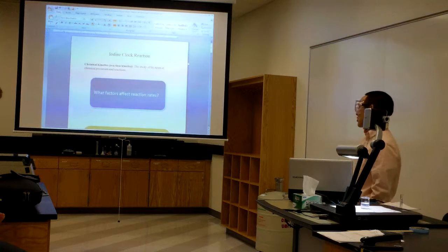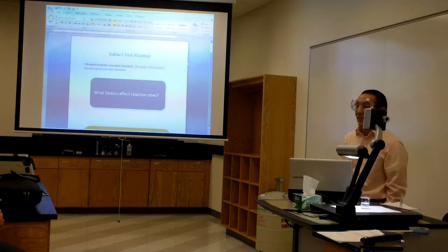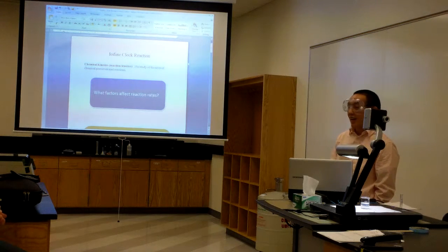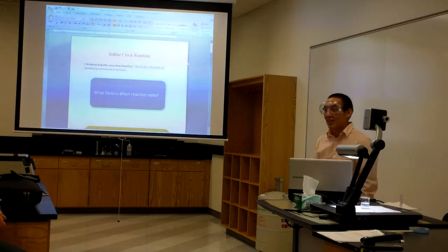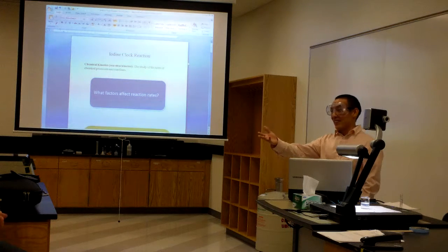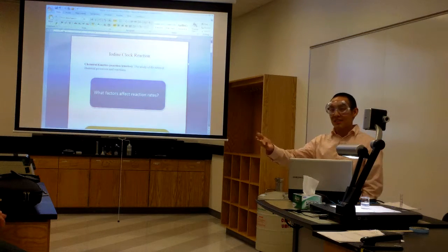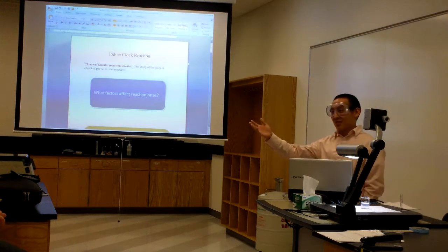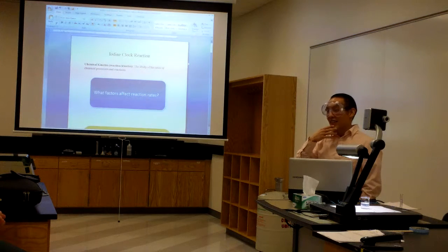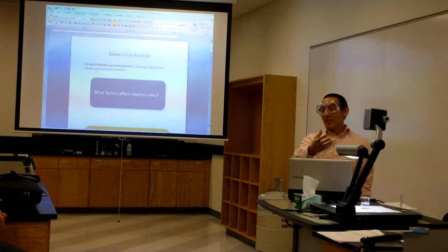And so I'll start off with a question. What factors affect reaction rates? Any ideas? Catalyst. Okay, the amount of the catalyst. And what other amounts? The products and reactants, concentration of products and reactants. What else? Temperature. Physical state. Volume. Okay, and then are all reaction rates going to be the same for every single type of reaction, or are they going to vary?